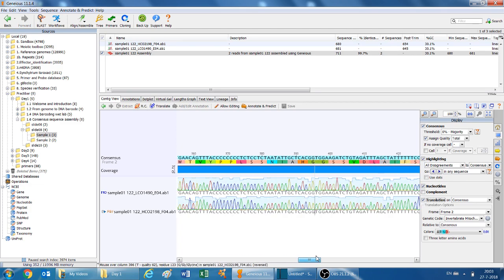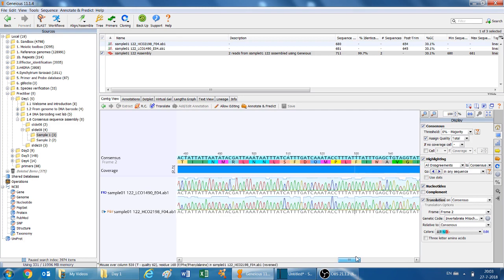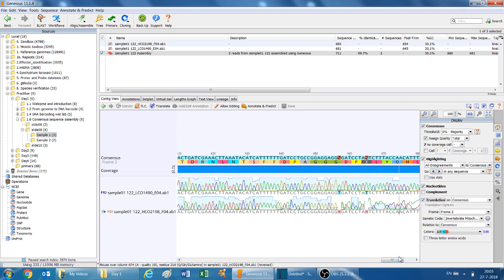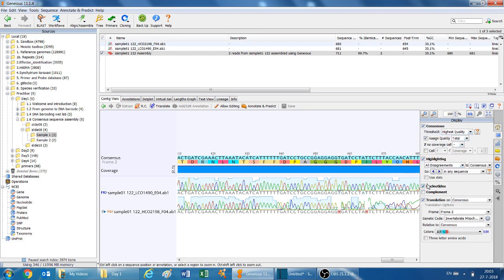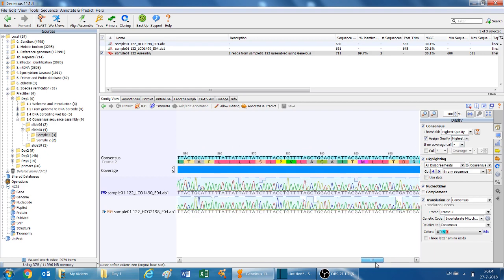Internal stop codons would indicate that you have maybe a pseudogene, or that you have artifacts in your assembly or in your sequence. So this we have to resolve. Nice, the quality, yeah. And you have very good sequence data in the opposite run that will allow you to determine if this overall consensus sequence is reliable. And this actually looks really nice.